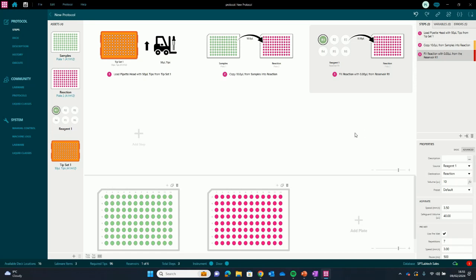So we've got 10 a sample, and then we're adding another 10 of the fill. And the interesting thing here is that we've got a number of presets for dispensing that you can drop down the menu, and generally that's all the fine tuning you need to do on the dispense head. Again, a little bit more of that later.